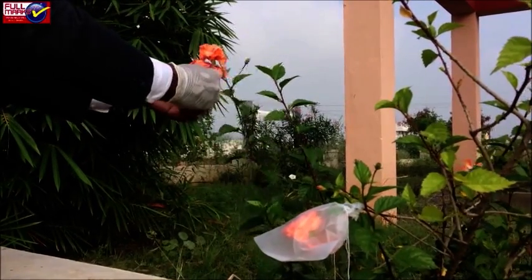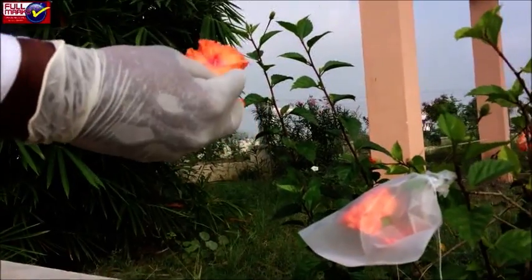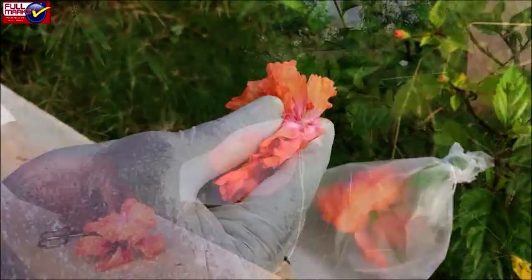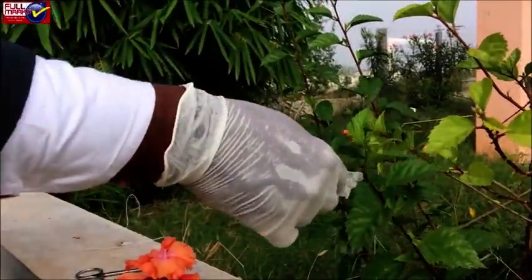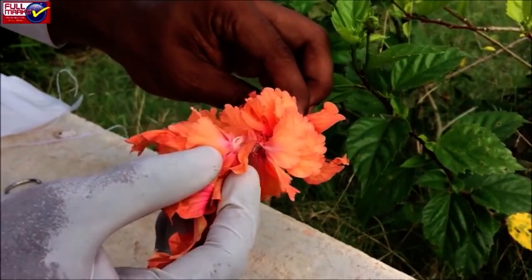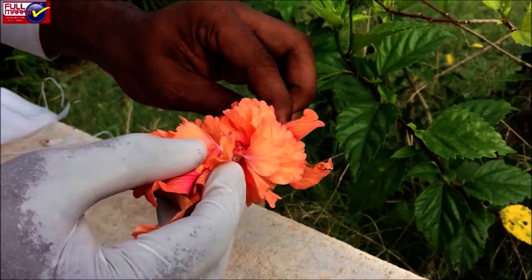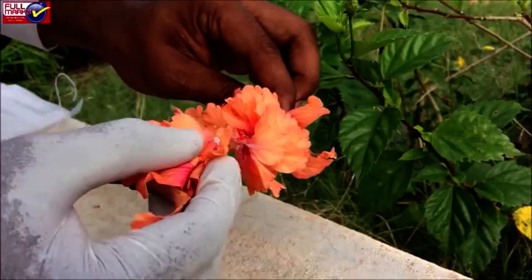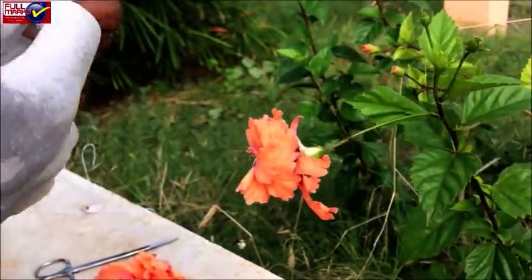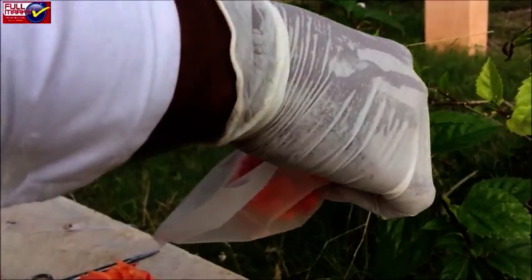Bring into physical contact the anthers of a desired male plant containing mature pollen grains with the stigmatic surface of the emasculated female flower. Use tweezers or a brush if necessary to dust the stigmatic surface with pollen. Then cover the pollinated flower again with the bag immediately, until seed setting is completed.